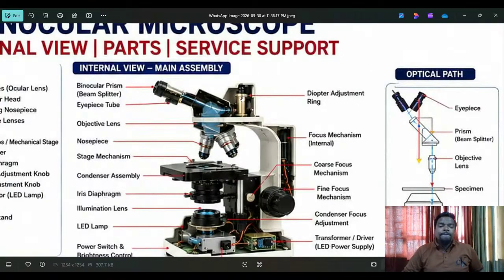Inside parts and internal views are mostly not possible to see, because in a hospital even a single moment is very important for the laboratory. If any laboratory is not working, the complaint goes to the medical superintendent level, and many cases will be postponed because without proper lab inspections nothing can go forward for any patient. The first checkup is very important. Only if it is finalized can the patient go to the operation theater, ICU, or wherever needed, and that depends on this laboratory equipment, the microscope. That is one of the causes.